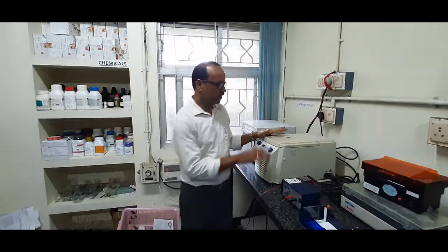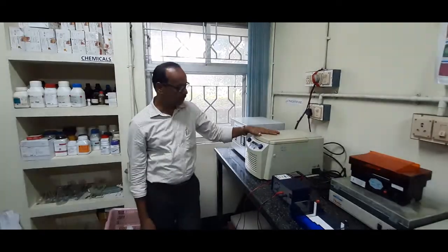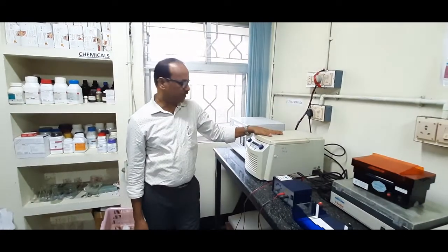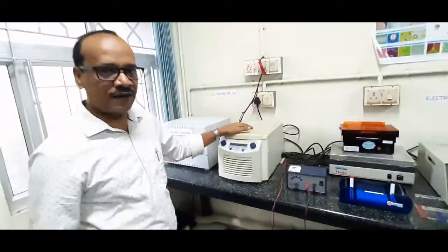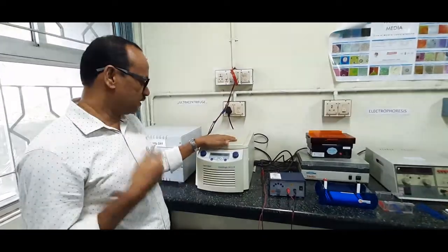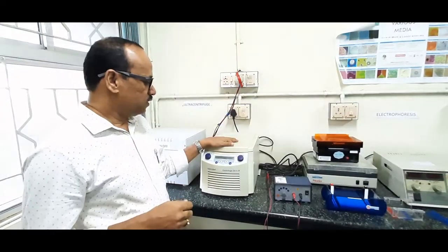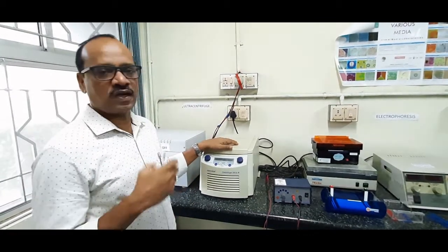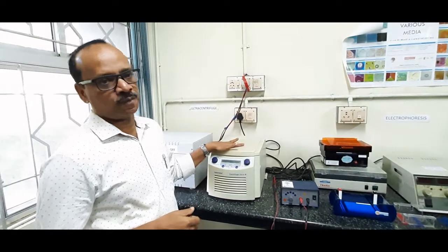The first and foremost basic instrument which every molecular biology lab should have is a cooling microcentrifuge. We know the principle of a centrifuge — in order to separate the different biological micro and macro molecules, we can separate them by applying centrifugal force. So that is what we do in the centrifuge here. In order to separate, say for example, nucleic acids, proteins and other macromolecules, we need to have this particular instrument.